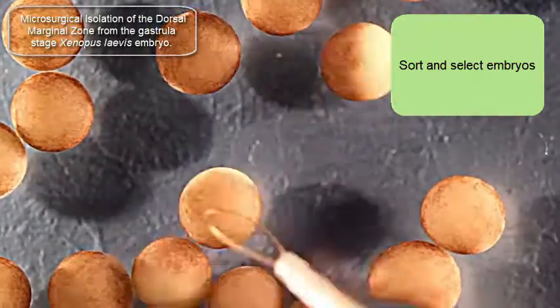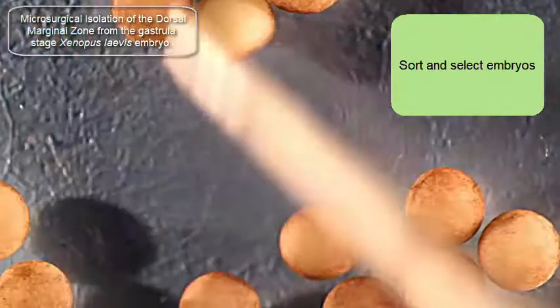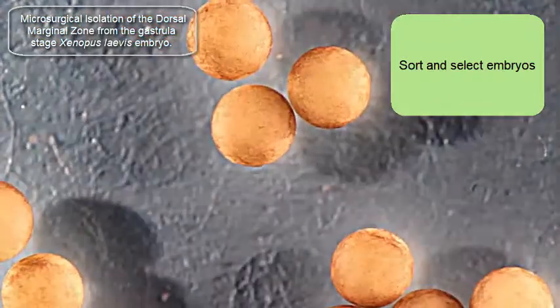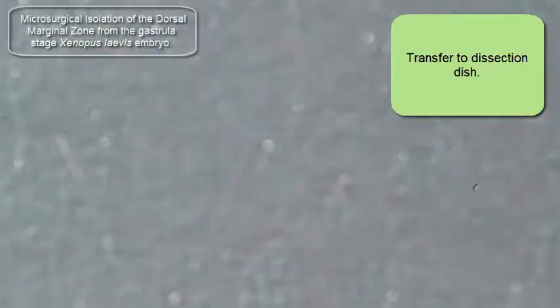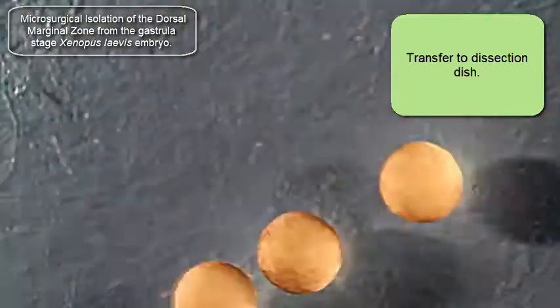Here I am sorting out some embryos to start with. I'm going to have a selection of wonderful embryos to begin. I'll pick these three and transfer them into my working dish with a Pasteur pipette.